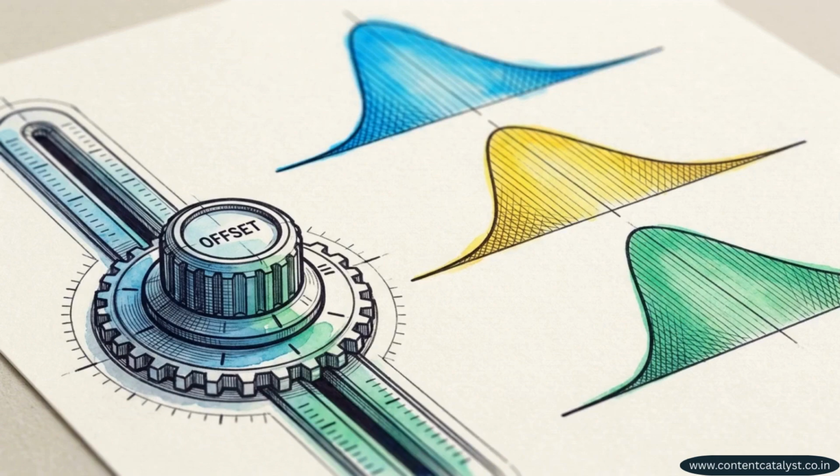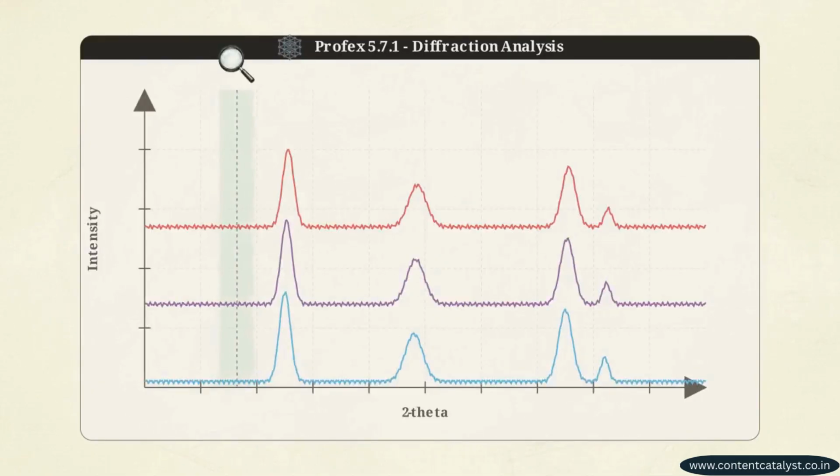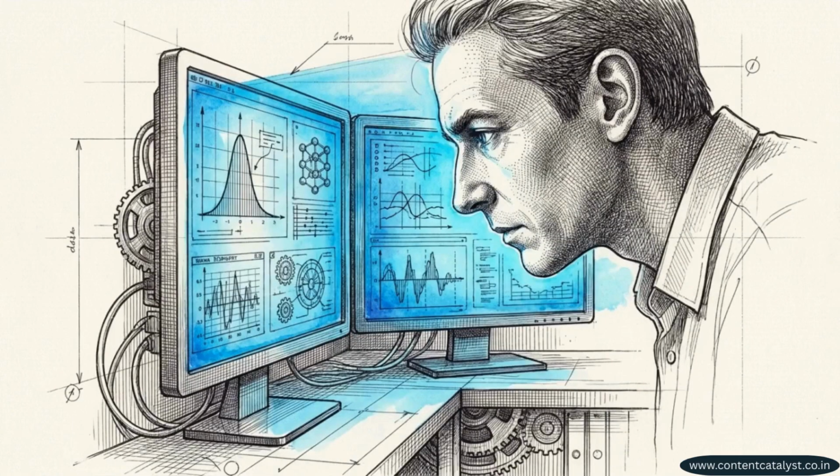The software also removes friction from the visual analysis itself, most notably by allowing instant offset application in the plot options for stacked datasets. Previously, adjusting a visual offset required a tedious cycle of clicking, waiting, and rechecking. That delay is now gone.